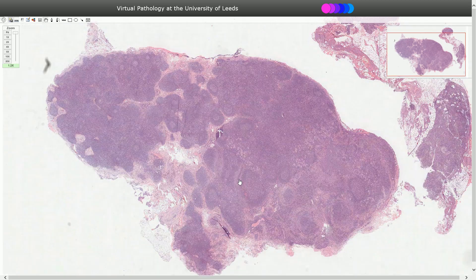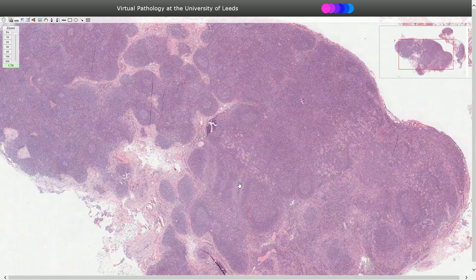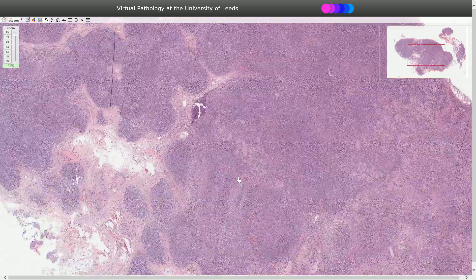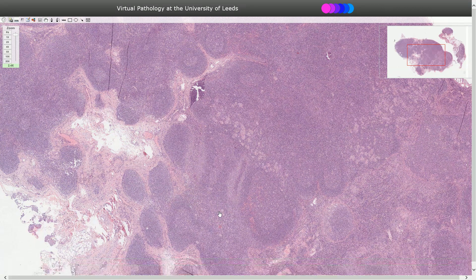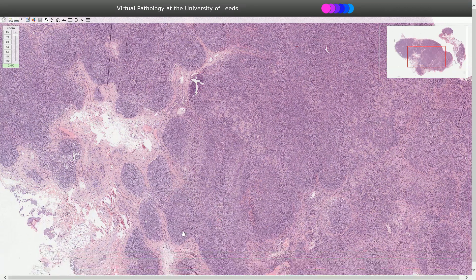The second sign is monocytoid B cell hyperplasia in the sinuses — seen in the paracortical area in between the follicles or in the subcapsular sinus. We can see these lighter areas filled with monocytoid B cells.